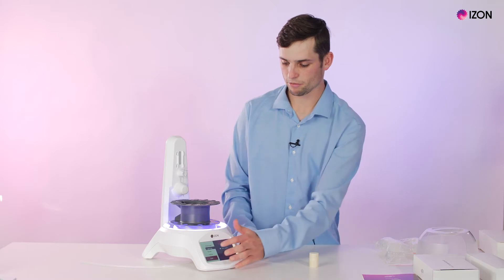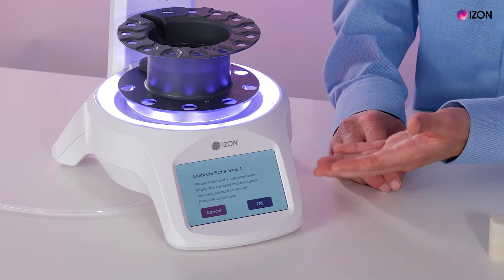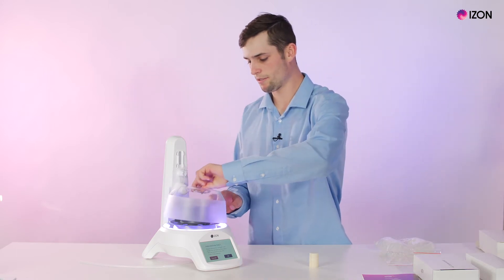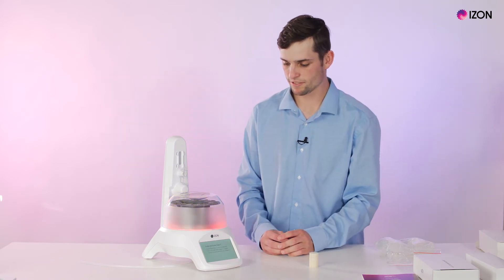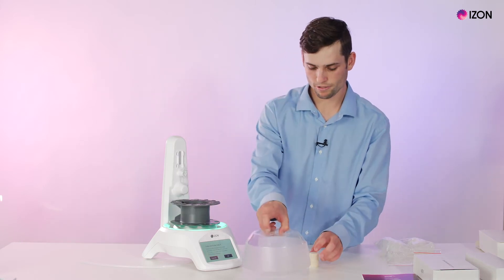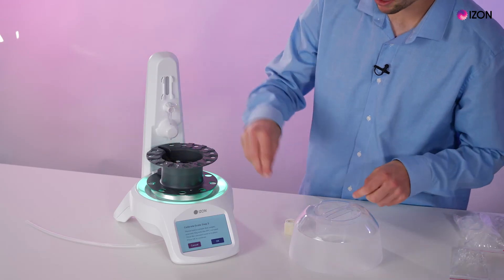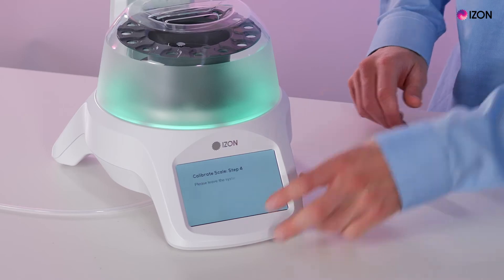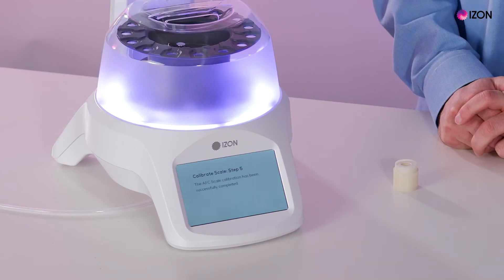To calibrate the scale we go into the scale function and push calibrate. You can easily follow the steps on the screen — it asks you to put nothing on the AFC. Grab the carousel shield and place it on top, press OK, and wait a couple of seconds for it to initialize. Once that's done, take the shield off. Grab the 10 gram weight supplied in the package, put it anywhere in the carousel, place the shield back on, press OK, wait a couple of seconds, and the AFC will calibrate.